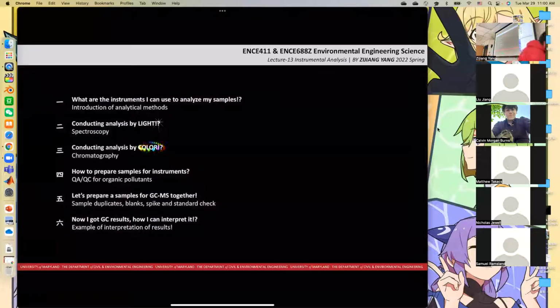We have 6 items to talk about today. So I will give a brief introduction about the instrumental analytical methods, and then I will focus on conducting analysis by light and by color.